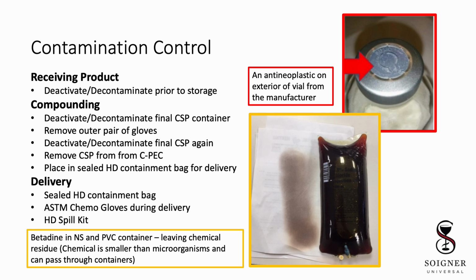When compounding, it's important to deactivate and decontaminate the container of the final preparation twice. Once prior to removing the outer pair of gloves and once after to reduce potential cross-contamination during the removal process. Always place the final preparation in a sealable hazardous drug containment bag for delivery in case there is leakage or breakage.